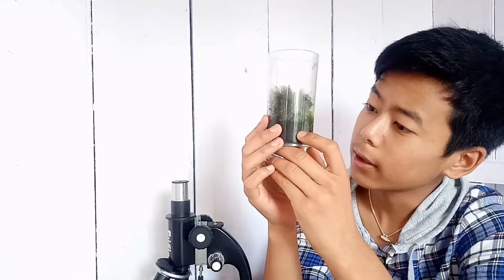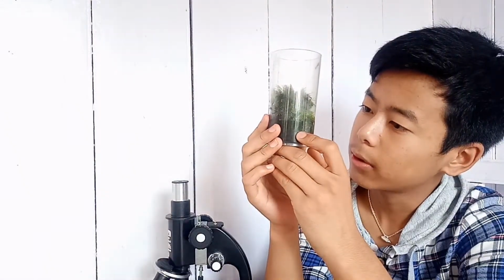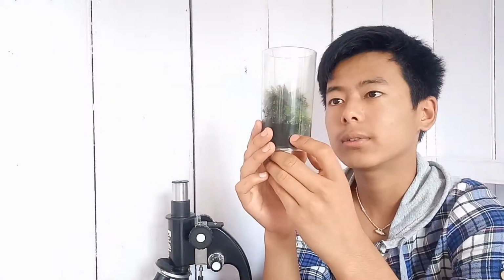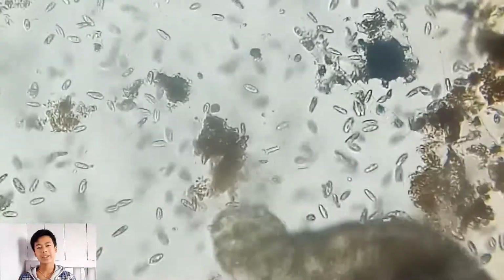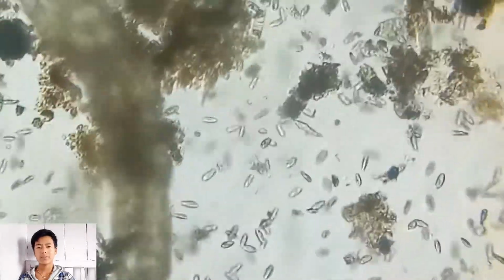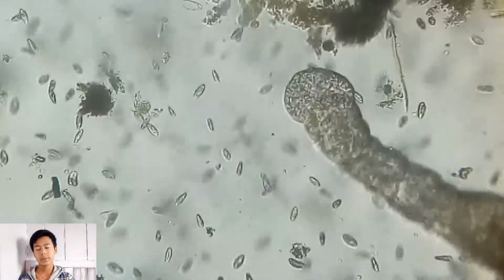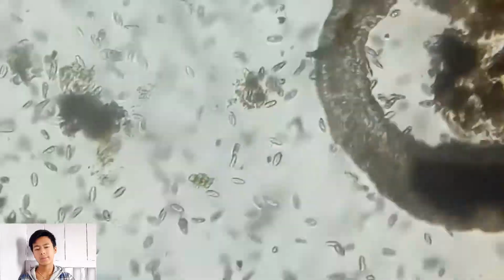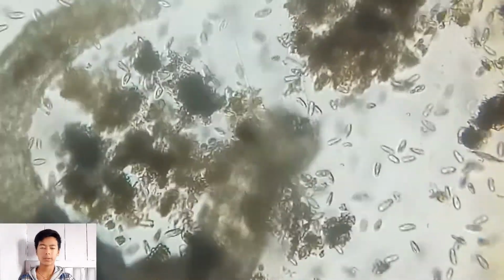And with my naked eye also I can see some organisms swarming this water. So this is some ciliates. So let me show you that footage. So as you all can see in the video, there are uncountable ciliates swarming this drop of water. As you all can clearly see the organisms, and here comes our aeolosoma also.